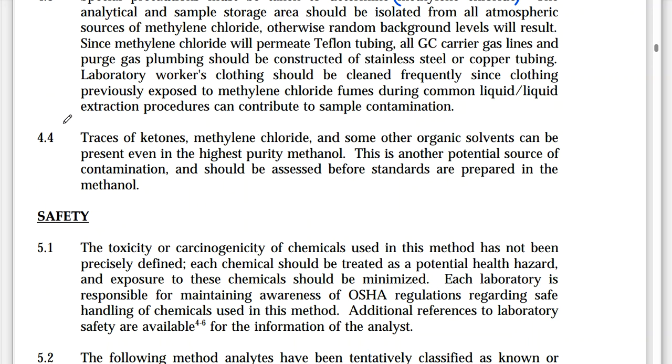4.4, you see that again, and it says traces of ketones and methylene chloride and some other organic solvents can be present even in the highest purity methanol. So this is another source of contamination, and we should make sure that we pay attention to this before we prep our standards and before we put methanol into every single thing across the board. So the idea of solvent purity is also a thing. So purity is going to be very important, especially for solvents.